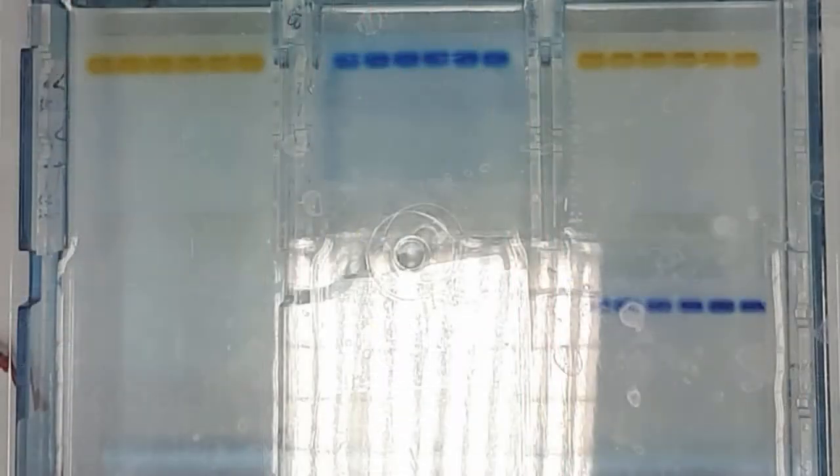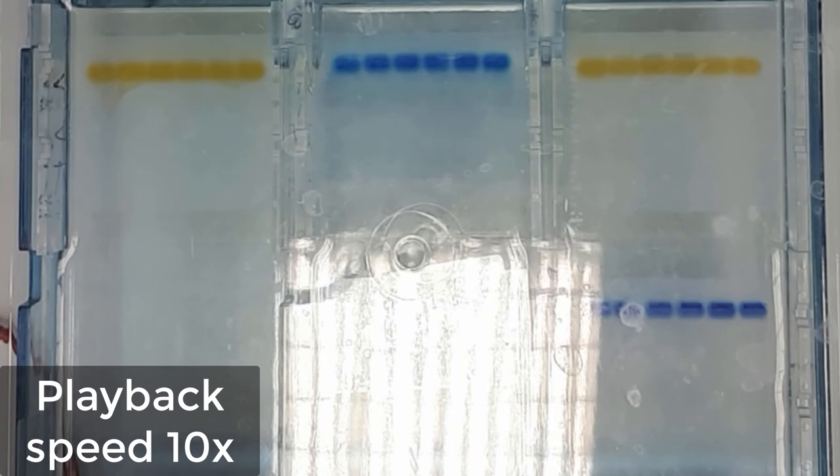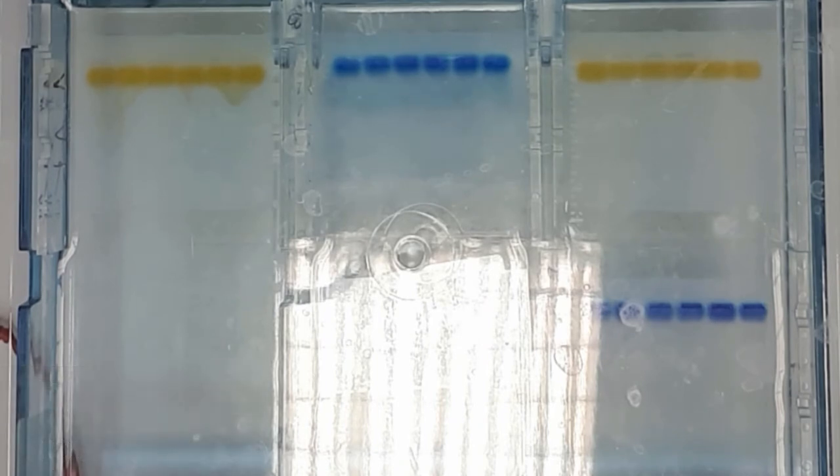In the playback you can clearly see the movement of the bands of DNA samples. When they go through about two-thirds of the gel length, we can stop the electrophoresis, turn off the power supply, and start with the imaging of the gels.